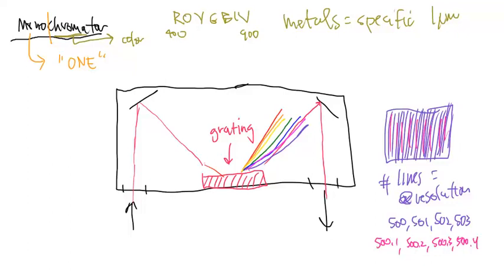This allows me to really focus in on one specific wavelength that I want. Instead of 512, maybe 512.4. Now, granted, most of the time in an AA instrument, whole numbers are going to be okay. This is not going to cause us a problem. We don't really need to go all the way down to the point where we're looking at fractions of a nanometer. Maybe in UV-vis, but not in atomic absorption. So that's the purpose of the monochromator. It takes the light from the bulb and it divides the light up into the specific parts.